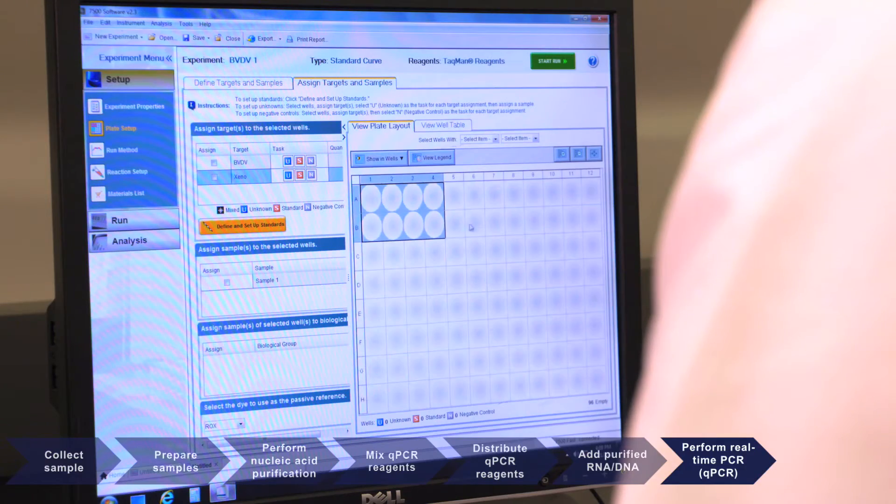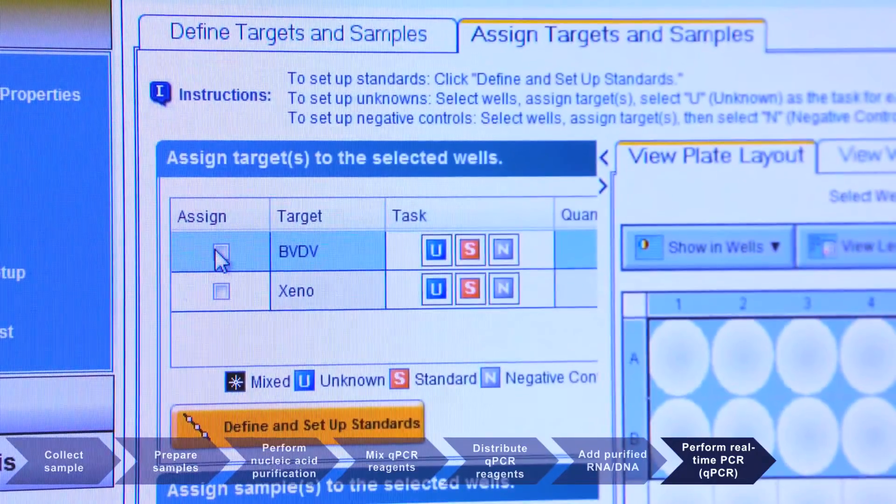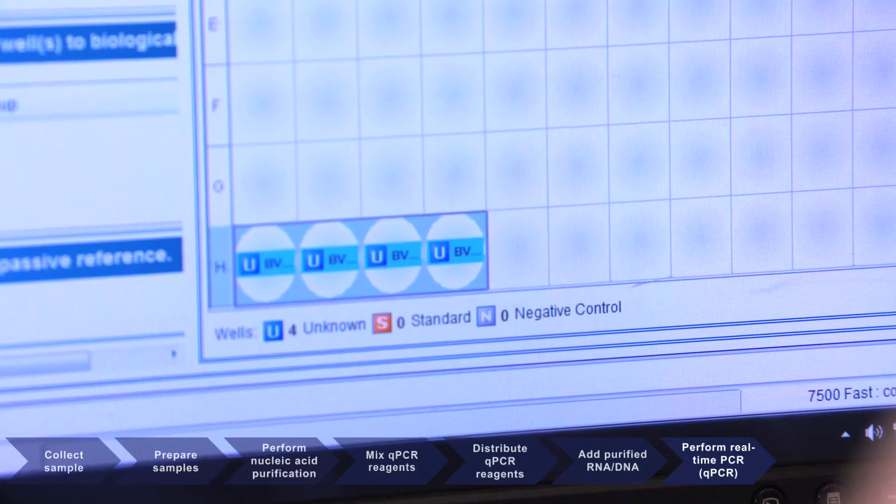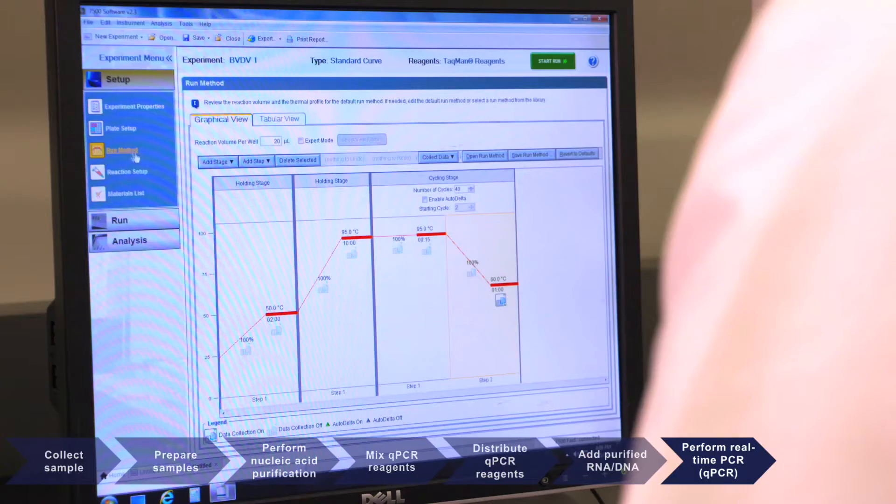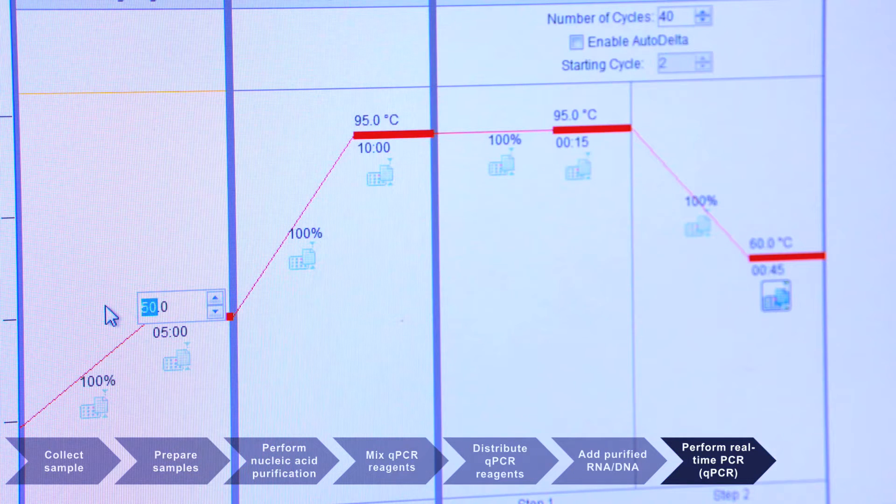Program the real-time PCR instrument by first labeling sample wells and then setting the thermal cycling conditions. Set the number of repetitions, temperature, and time necessary for each stage of the run.